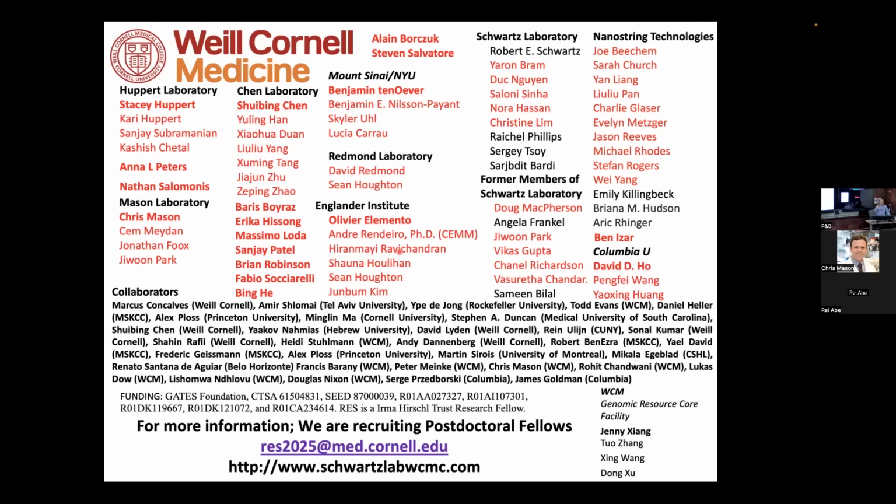In a more perfect world, we'd actually have some data so you could say, oh, I need to acquire X amount of surface area of tissue. But because there's been so little data before, it's been hard to do that.